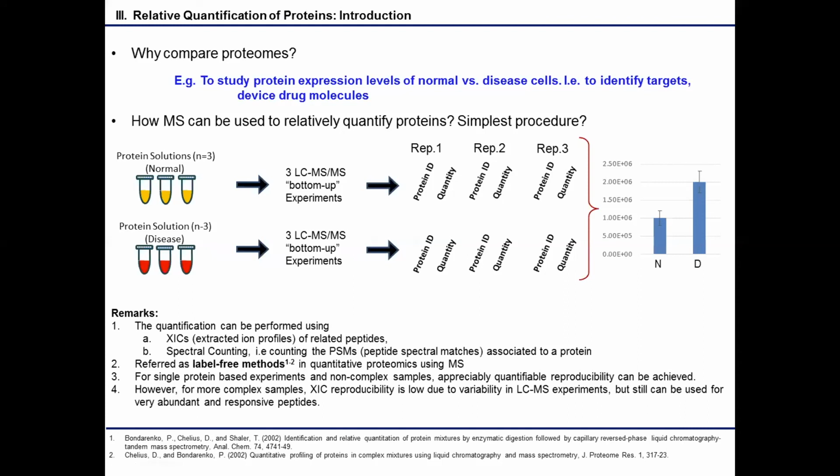And finally, Western blots are also very sensitive to saturation effects. Many of you that have worked with Western blots know that a lot of the software will give you an indication that you've reached saturation, but you can also really heavily saturate things if you expose on film. That's something we don't have to deal with in a mass spectrometer, partially because we have that dynamic ion filling that I talked about earlier. So we really avoid that saturation point, at least in that way.